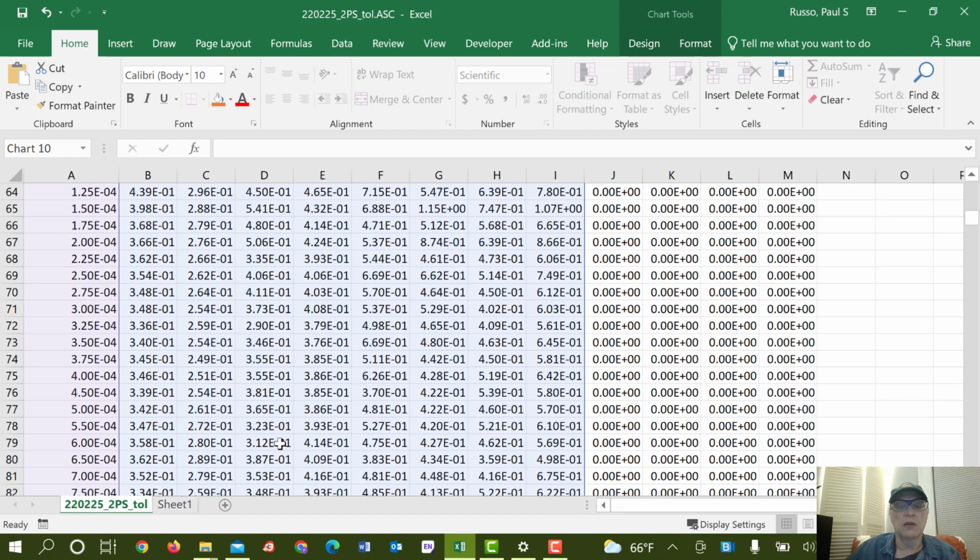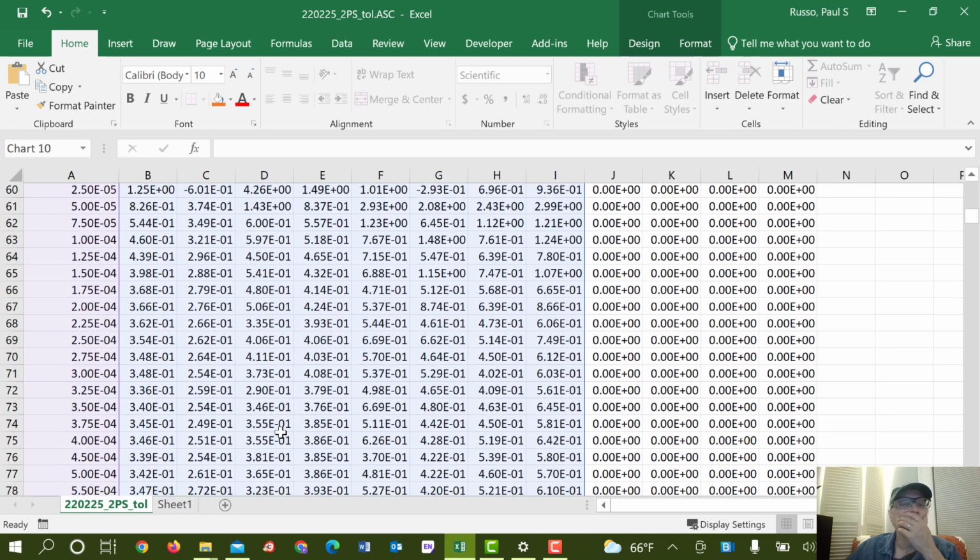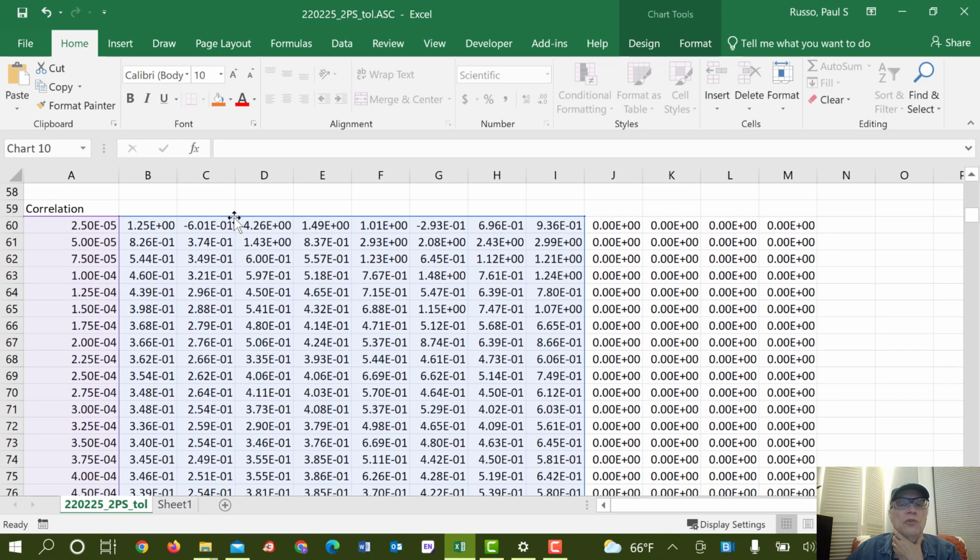Okay, and lose some of those early channels. So here's 1.3, 0.6. Actually, it dives down pretty quickly from 1. But I'm going to just snap it down to like about, there.